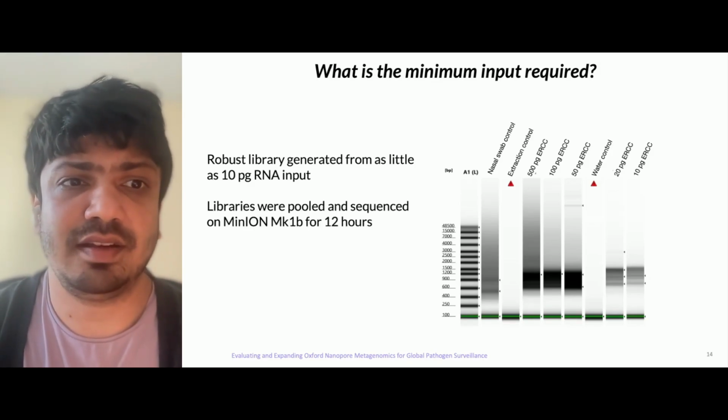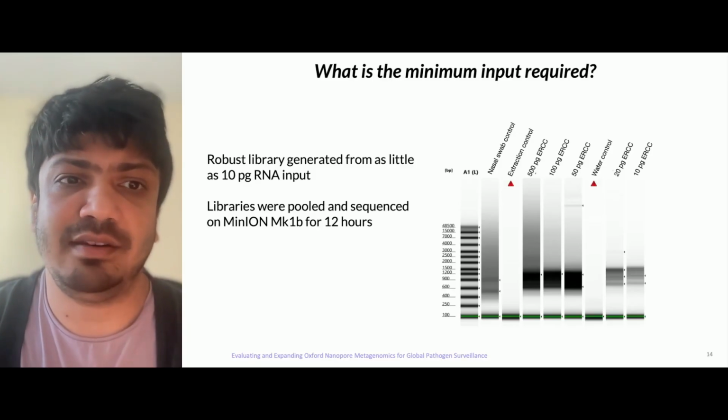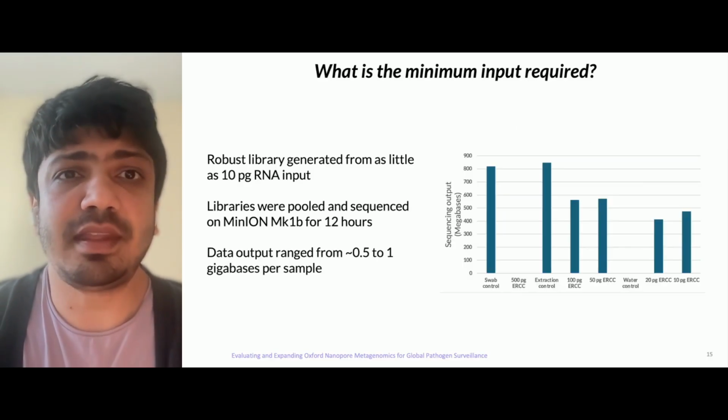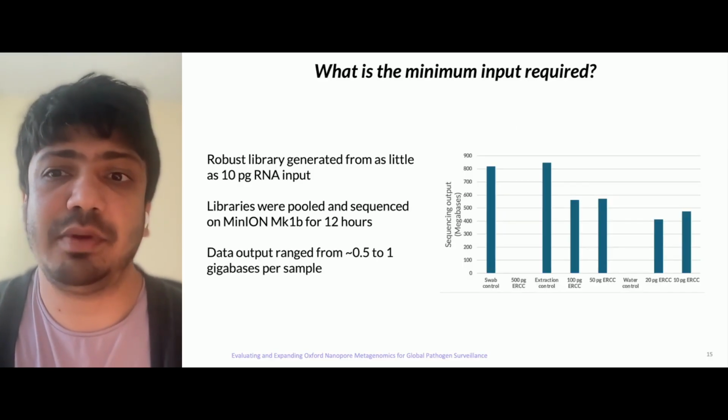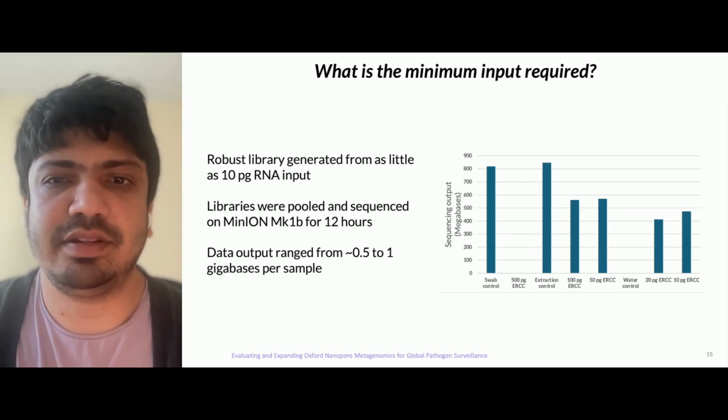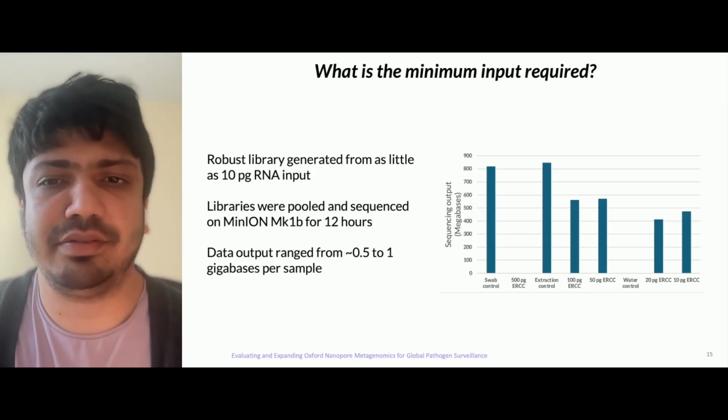So after this, we went ahead and pooled these libraries and sequenced on the MinION. And indeed, we were able to get good sequencing data even at the really low input amounts.